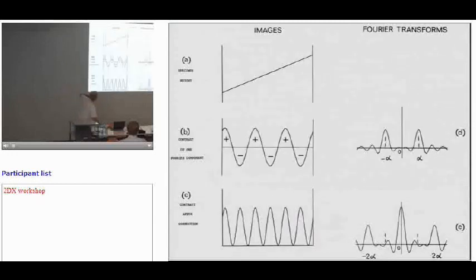Okay, so that's untilted. So here, if your image is tilted, this is the height in the specimen, so that's one side of your image, and here is the other side, maybe a micron different in height. And because the defocus is changing, in the contrast transfer function formula, sine chi is proportional to delta f theta squared, where theta is the diffraction angle. I think Carsten had it as alpha. So if the height is changing across the image, the delta f is changing.